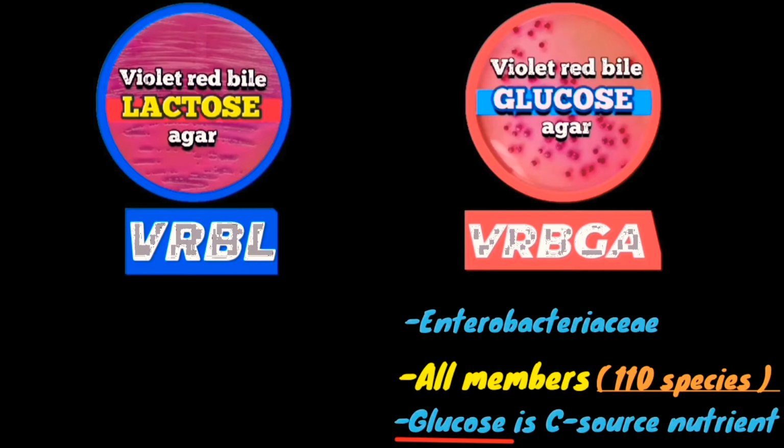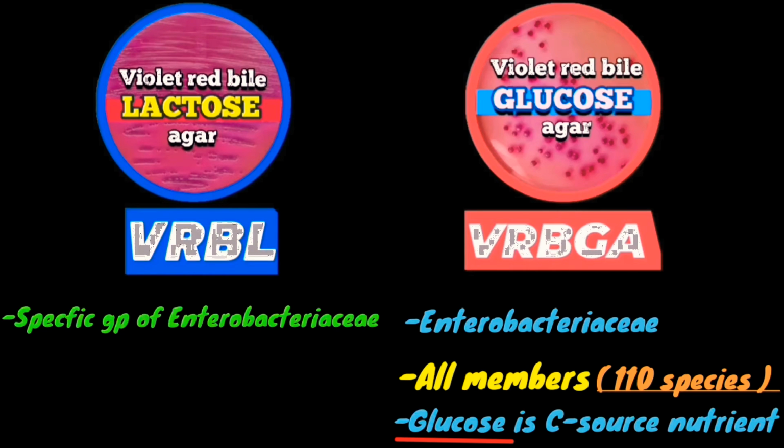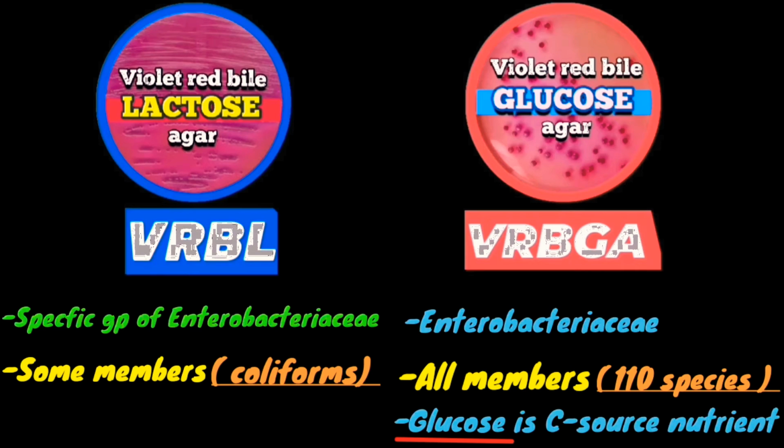While violet red bile lactose agar is used to detect a specific group of the Enterobacteriaceae family, because not all Enterobacteriaceae ferment lactose, but only a specific group of Enterobacteriaceae which have the ability to ferment lactose, and it is termed coliforms, the lactose fermenter Enterobacteriaceae.